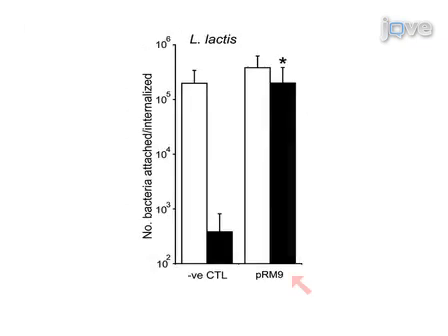In this experiment, Lactococcus lactis expressing the fibronectin binding protein was shown to be able to invade host cells, whereas bacteria not expressing the protein were not. The ability to adhere to cells was the same for both strains.